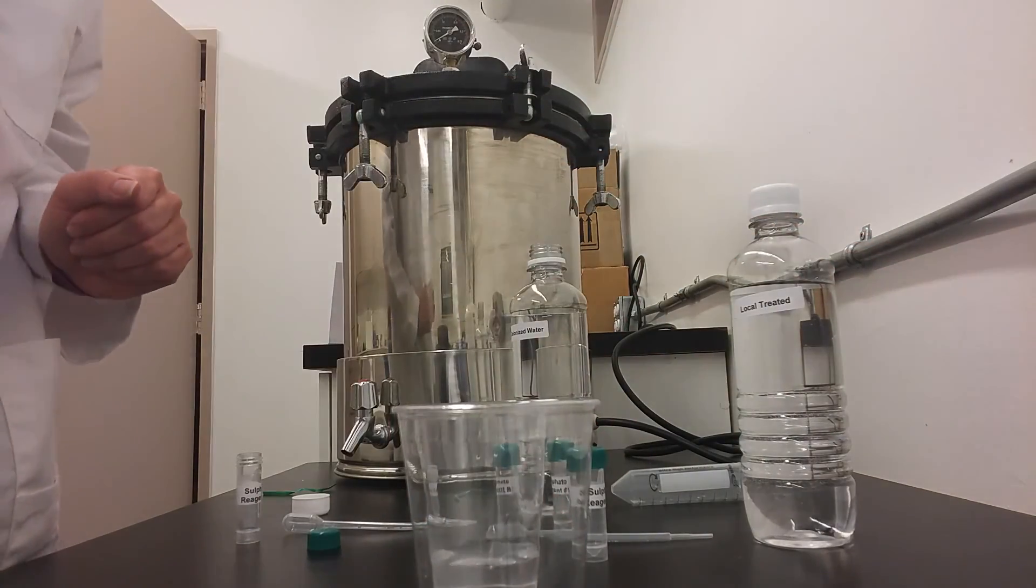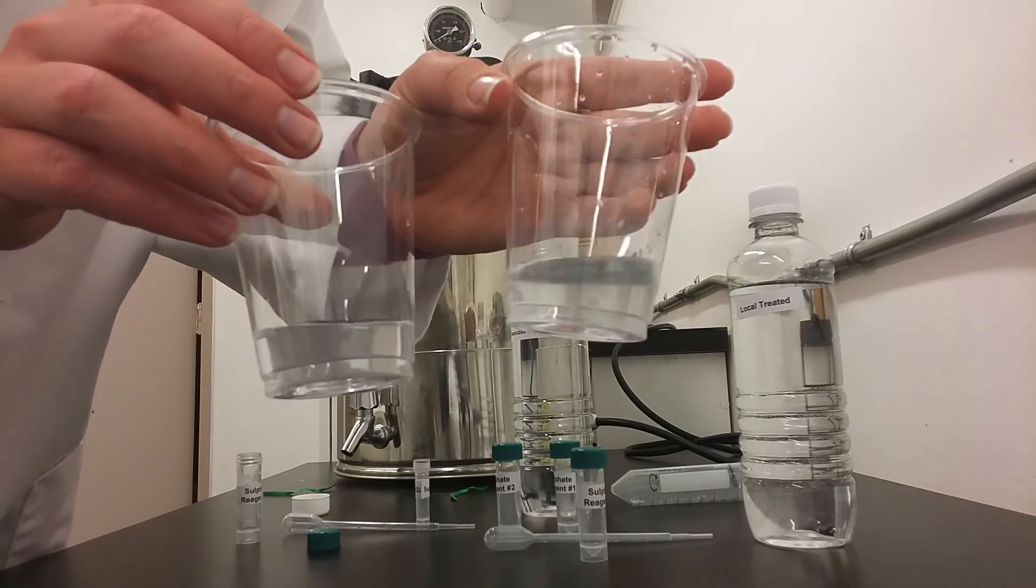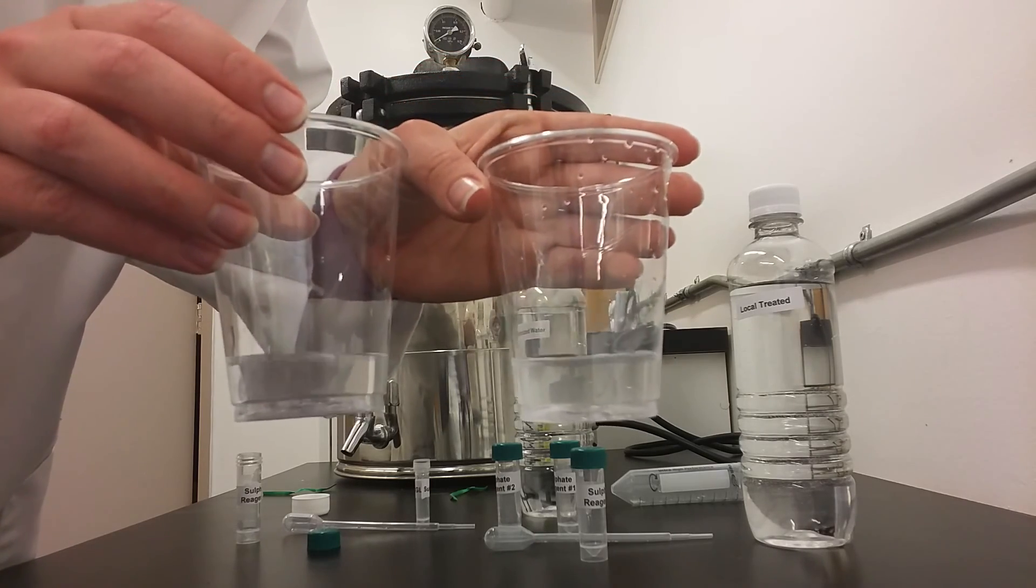Now, in order to perform the test, you will compare the cloudiness of different cups to each other to determine the levels of sulfate present in the water.